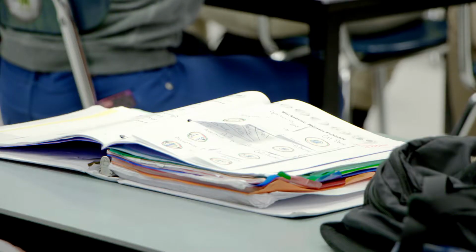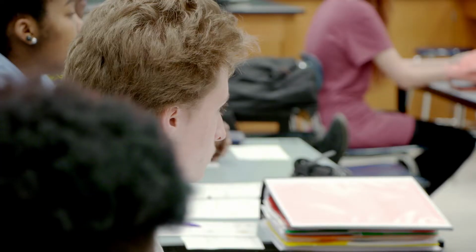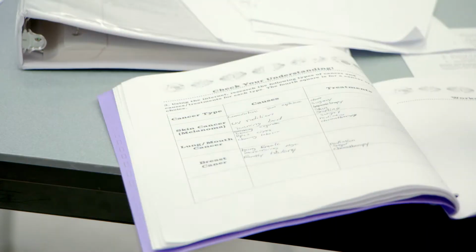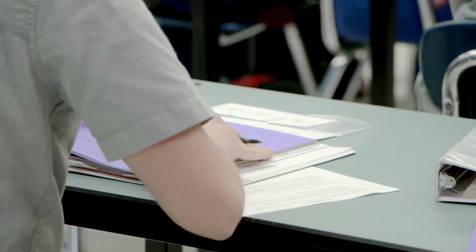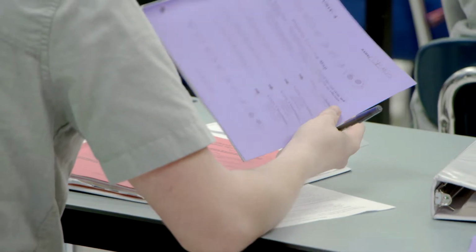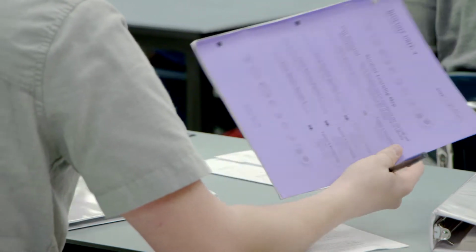My students will only be able to use the foldable we've been working on for the past 2 days. And the foldable has everything in it. It has pictures of the stages of mitosis, it has a description of what's happening, it has how long each stage takes. So they'll be using that to help identify what they're seeing under the microscope.